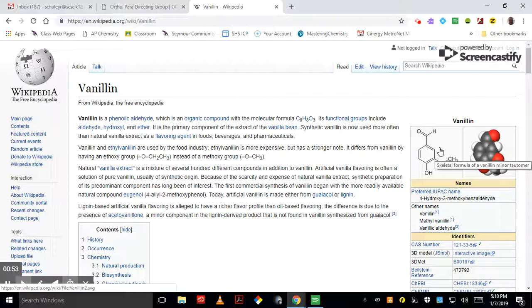So in terms of our experiment, we have some materials. We're a large paper company in this case, and if you treat some of the materials from a paper company, the chemical called lignin, one of the products that you can get is vanillin. And it turns out that what he wants to do is, Woody Aspen is the name of our director at Pulp Chem, wants to develop a new product from vanillin that might be marketed commercially.